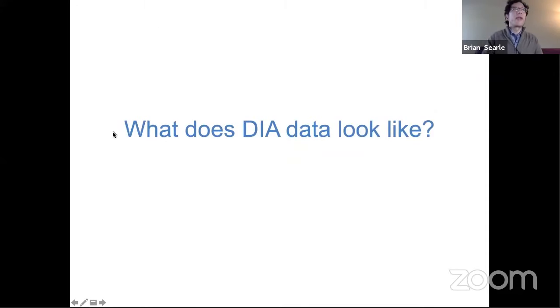Okay, and so before we get into what DIA data look like, I'll try to answer a couple of these questions. When considering peak widths, typically I think about the base to the base, right? Rather than the actual half height, because some types of peptides will be acquired across a large retention time and have very long tails. Even that level of information is still useful for helping to describe the shape of the peak. So if you still have long tails, that can be, in this case, still appropriate for describing the shape of the peak.